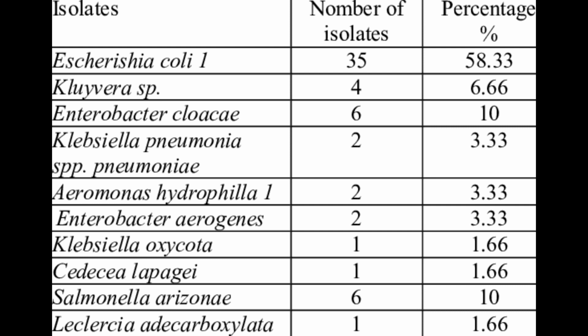This explains that the enteric may either have lysine decarboxylase and produce purple over purple, or have lysine deaminase and produce red over yellow, or lack both enzymes and produce purple over yellow. However, the enteric organism will never have both lysine decarboxylase and lysine deaminase.